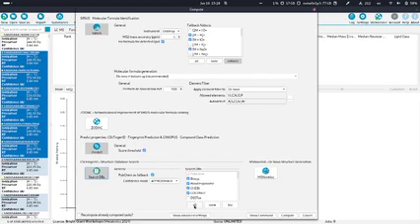There's also buttons at the bottom: all, none, and bio. All just turns on everything. None, for example, if you want to deselect everything to only use, for example, your custom database. And bio, which automatically selects all the databases which are part of our bio structure database.